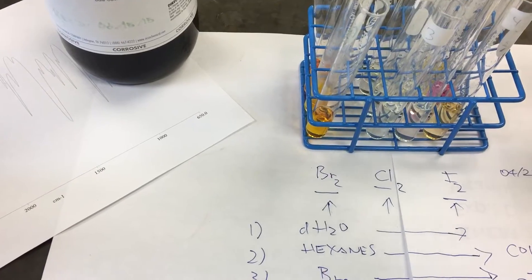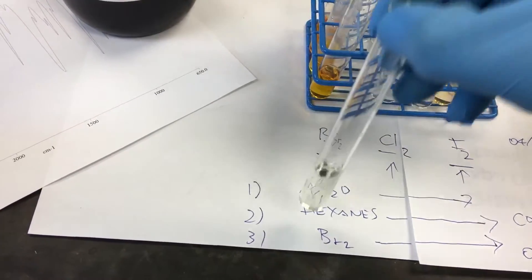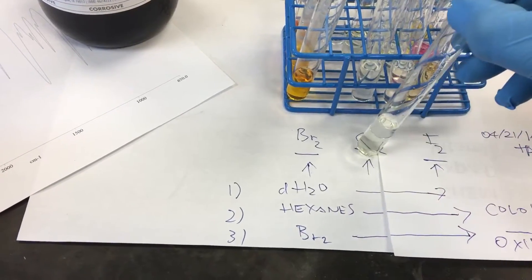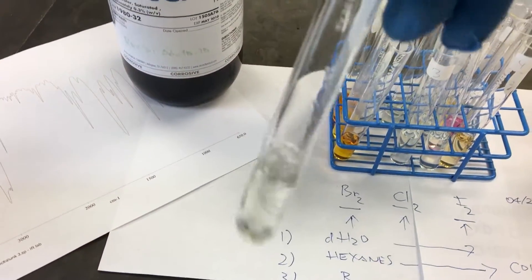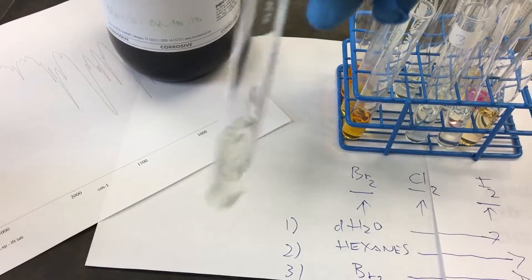Go to the second. There we go. Hexanes and chlorine. It's a light yellow-ish color.